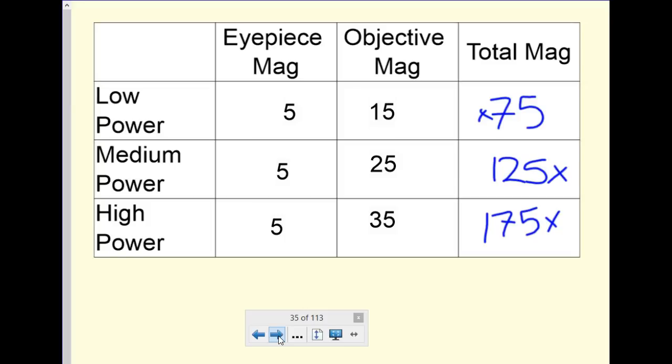You're going to lay it out on your slide. You want to watch out because this is moist living tissue. So wet your fingers a little bit and put a drop or two of water on the onion skin so that it doesn't shrivel up.